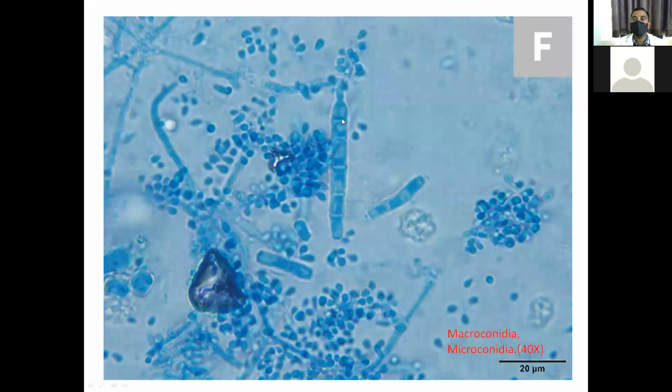Then you move on to another slide. That one is dermatophytes. In dermatophytes, Trichophyton mentagrophytes, these all are macroconidia. Trichophyton, Microsporum, Epidermophyton, this one. These are macroconidia, and these all are microconidia. Macroconidia are big in size, and microconidia are small compared to macroconidia. Dermatophytes.